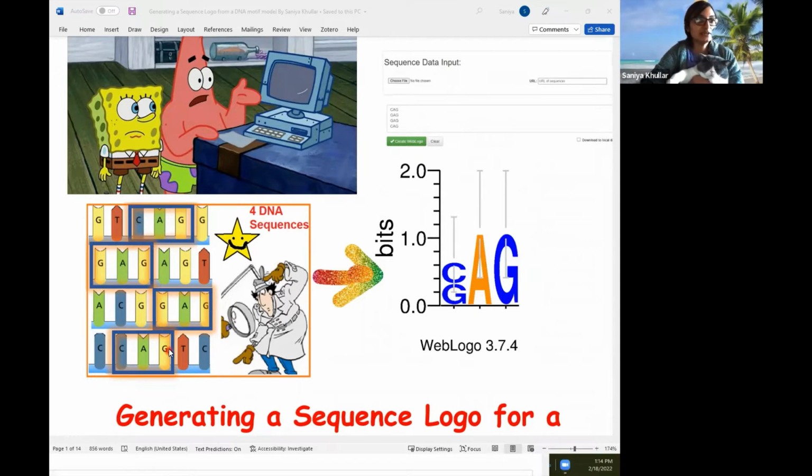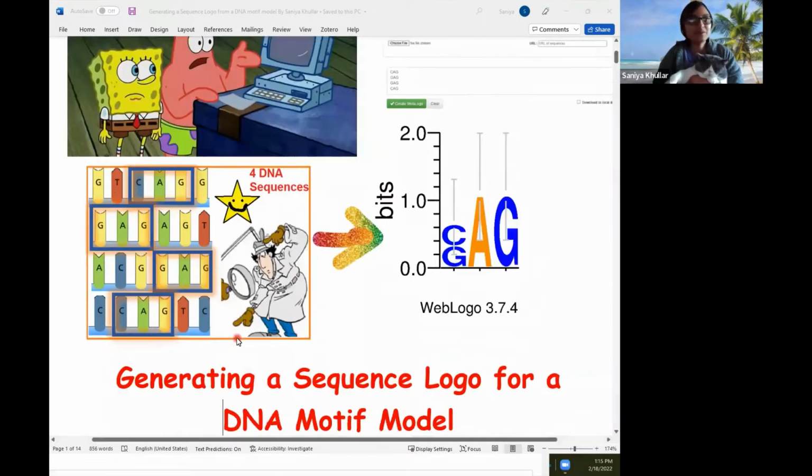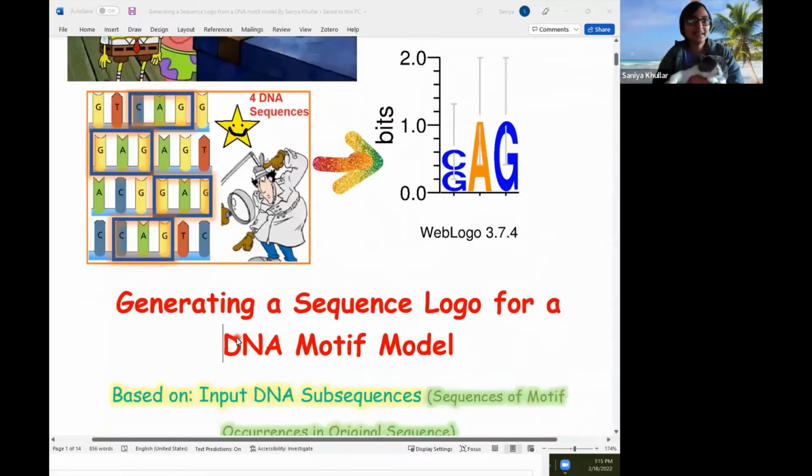We don't see any other bases here. Then the second one always happens to be an A, so that's pretty high up, and pretty much a 100% guarantee. And then G in third position, because the last one is always a G here. But we're going to talk about that and motivate that as well.